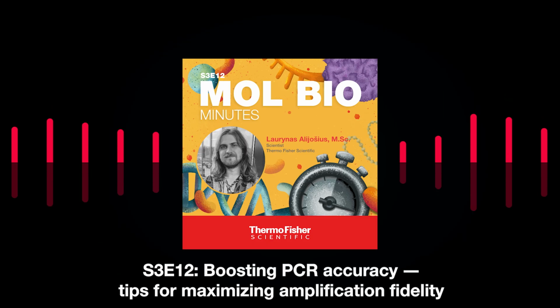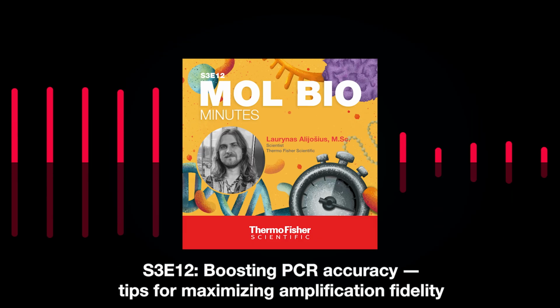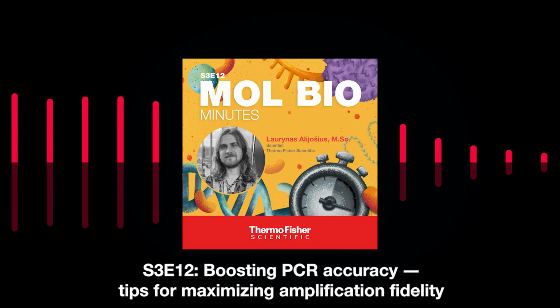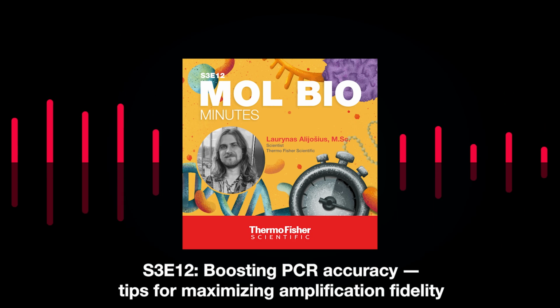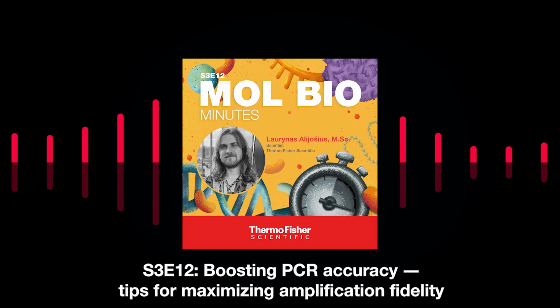And another thing to be mindful of is to avoid using low annealing temperatures for your primer annealing, because that can increase the chances that your primers will bind non-specifically, and eventually that could lead to some non-specific amplification too. As you can see, there are many factors that you can go into detail about and that can affect the accuracy of your PCR. So, what can make the accuracy go low, right?